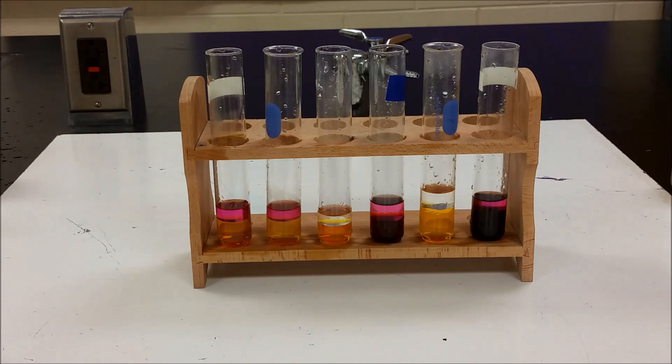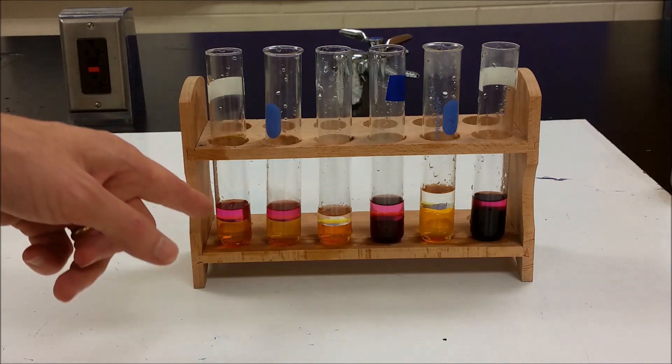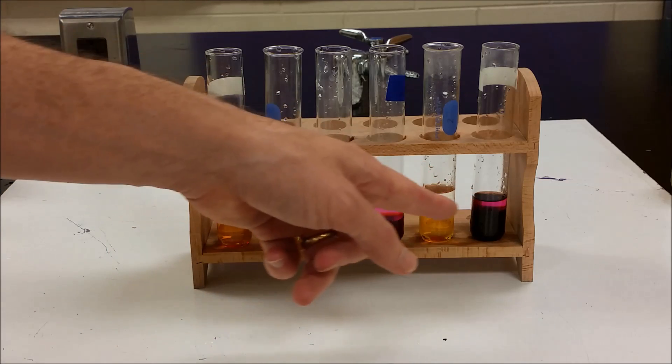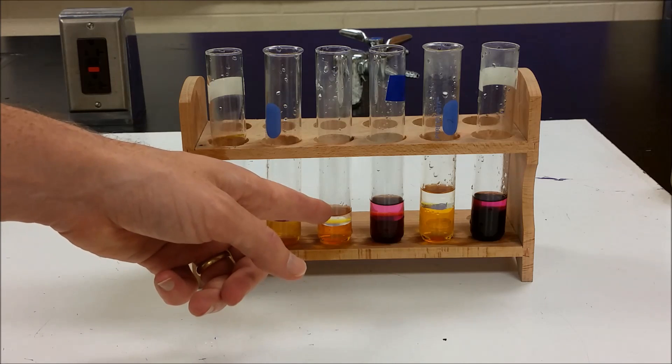Anytime we started with chlorine, it reacted to form chloride. That also means that the iodine is the least reactive because the iodine doesn't react with anything. Now bromine is kind of the intermediate.